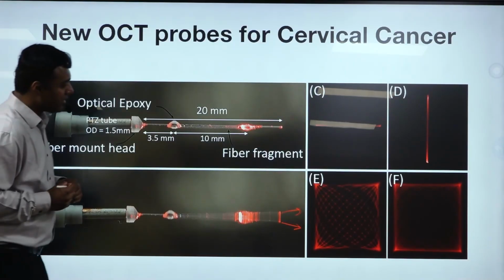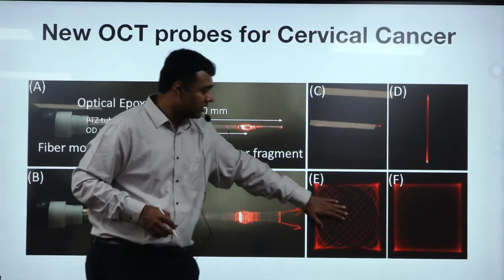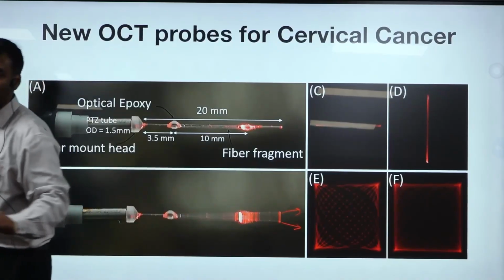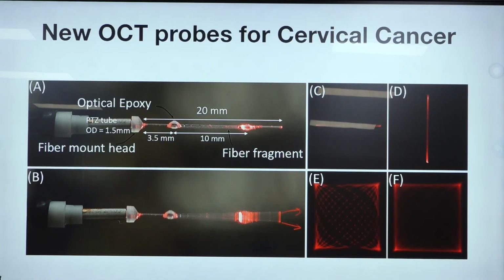And the next thing is, what kind of scanning pattern should you use? If you apply a sinusoidal voltage of one frequency along the x-axis and a sinusoid along the y-axis, it turns out that you get these kinds of patterns. Have you seen this before? These are called Lissajous patterns. You might have done this in your physics lab or seen this in a few other places.